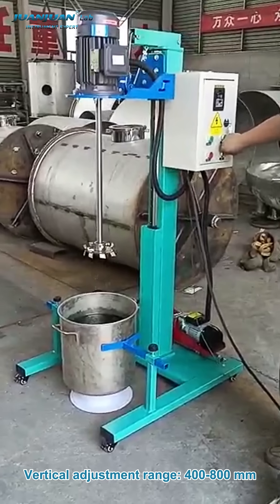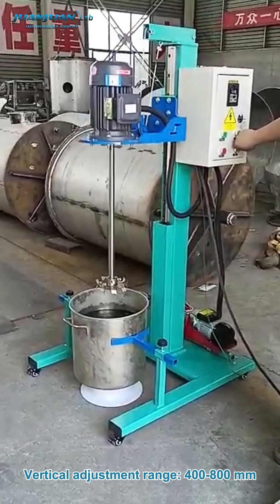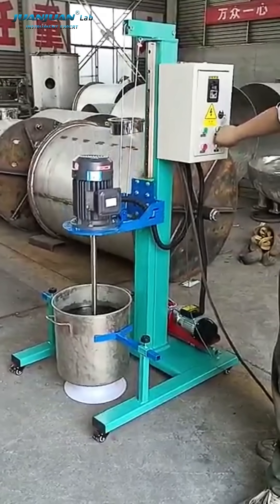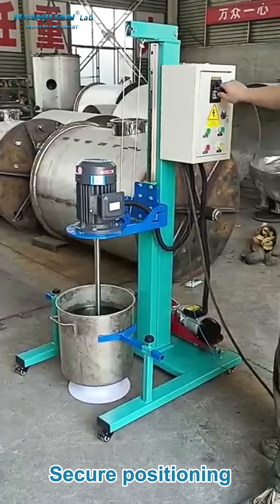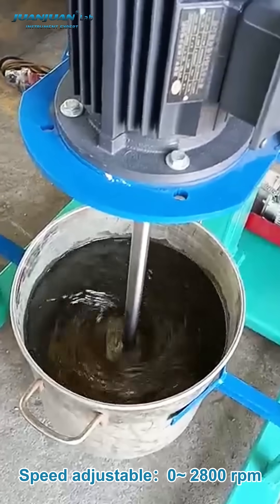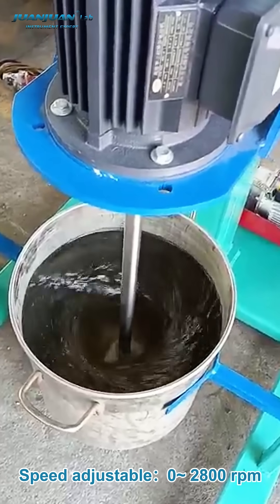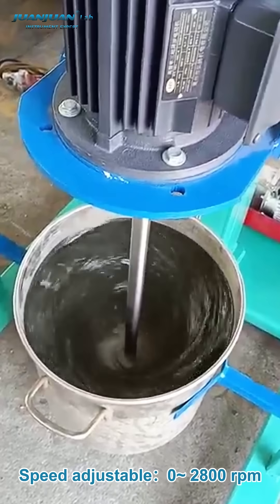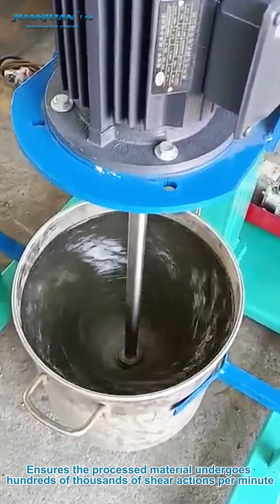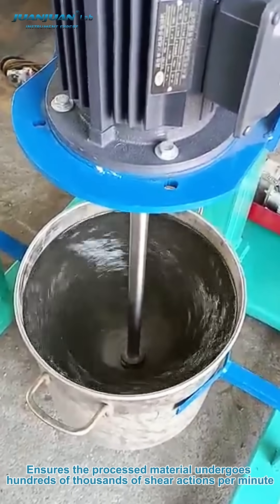Vertical adjustment range of 400 to 800 millimeters, smooth lifting, easy operation, secure positioning, low vibration and low noise. Speed is adjustable from 0 to 2800 revolutions per minute, ensuring the processed material undergoes hundreds of thousands of shear actions per minute.